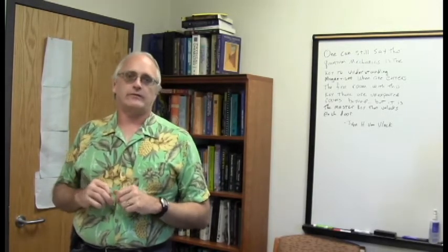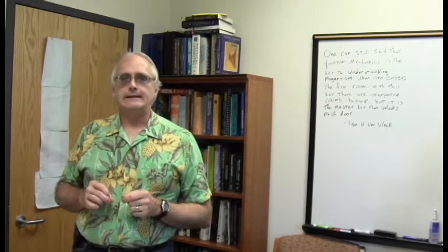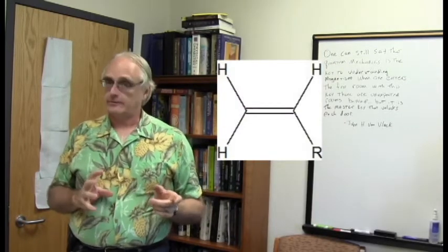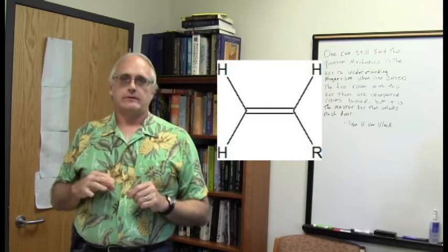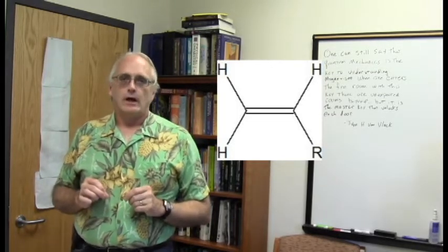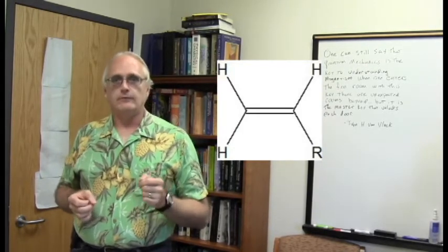And if it does have some symmetry in there, then look at our terminal alkene. It features these 2 protons that are chemically distinct, and then this one here trans to one proton and cis to the other on the terminal CH2 group. They would all give integrated ratios of 1 to 1 to 1.